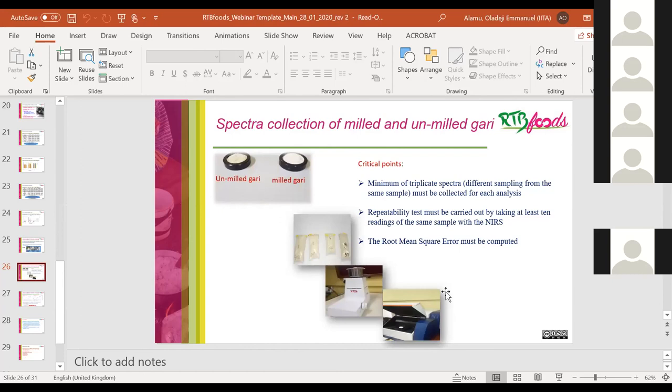Yeah, because what we are thinking is, if you have done your repeatability test very well, and the SOP is standardized, then we believe that triplicate values should be able to give us the result. That's what we are thinking. We can discuss that in WP2 and say, okay, for texture measurement we need to take so many replicates. So that will be a standard rule for the whole house. Because we believe that this SOP is already tested. It's okay, but the replicates will depend on the material. So we cannot generalize replicates. It depends on the product being analyzed. Okay. We can discuss it for a bad product now, because we are taking it later.